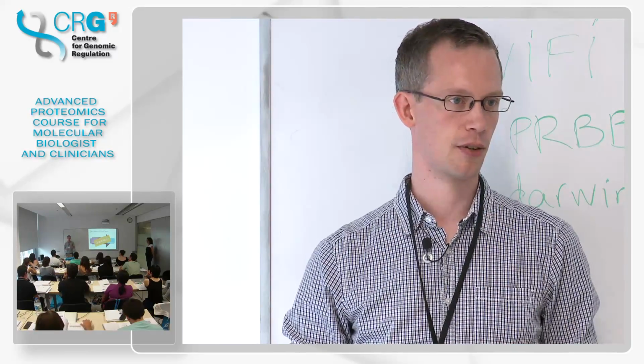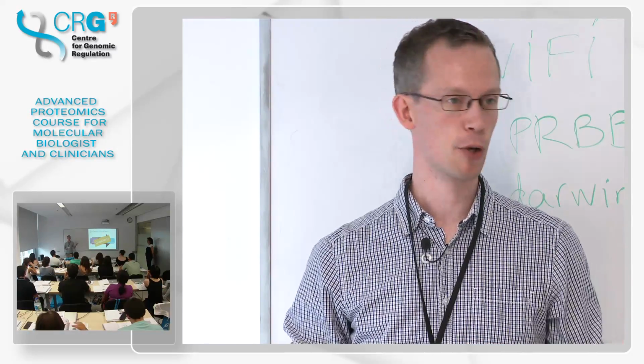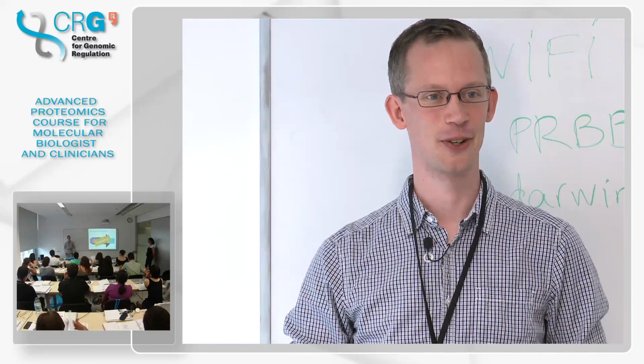Like PLGS, that's for Waters. I mostly work with Thermo instruments, and I'm a bit biased in that direction. Apologies to those.